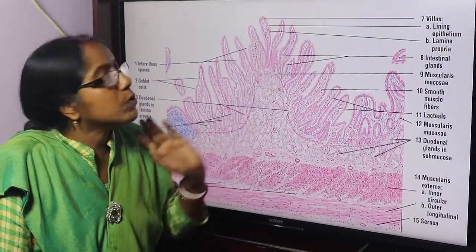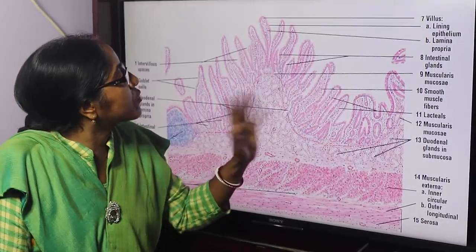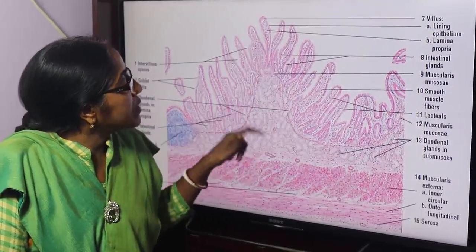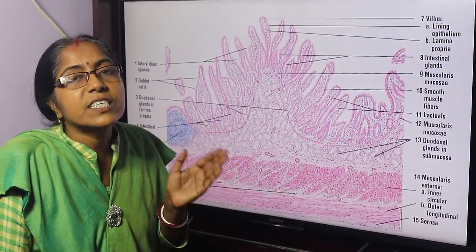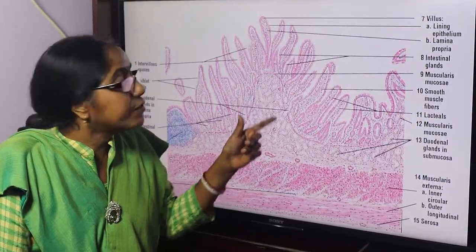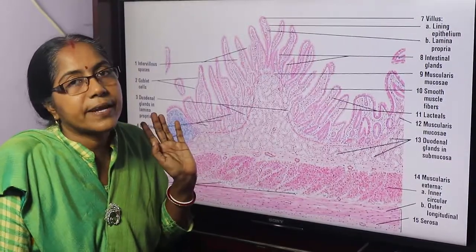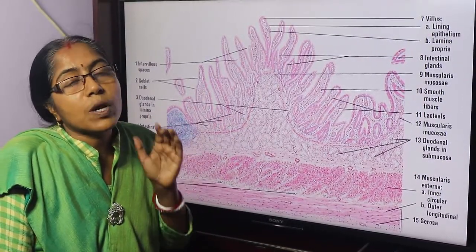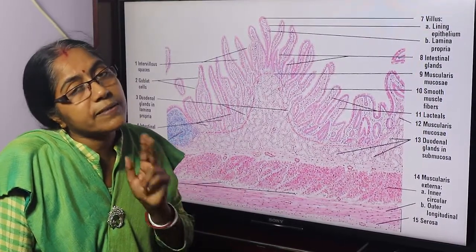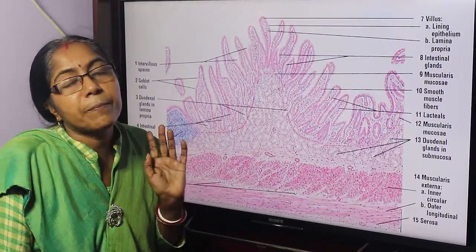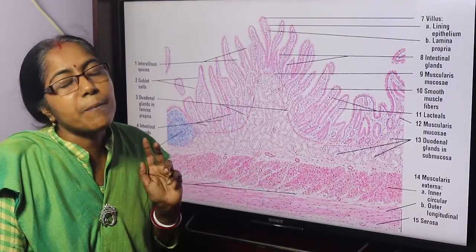Now, the submucosa — this is very important. Brunner's glands are the characteristic feature of the duodenum. The submucosa is packed with Brunner's glands. Usually glands are found in the lamina propria, but this is the exception — Brunner's glands are a submucosa gland, also called duodenal glands.